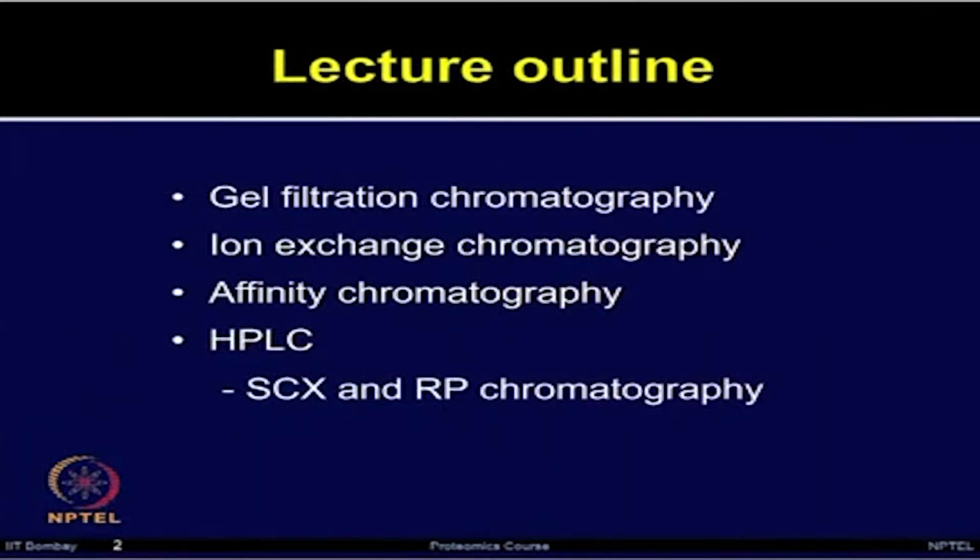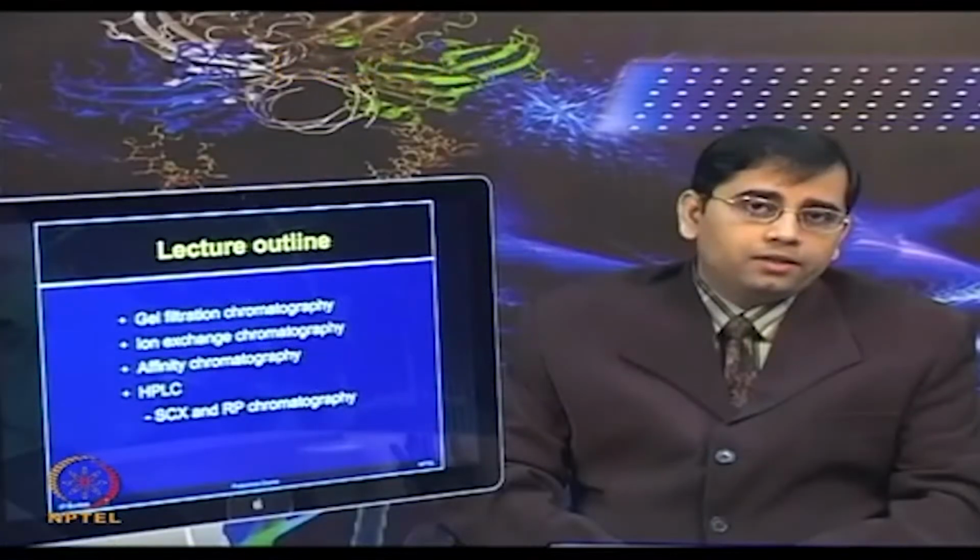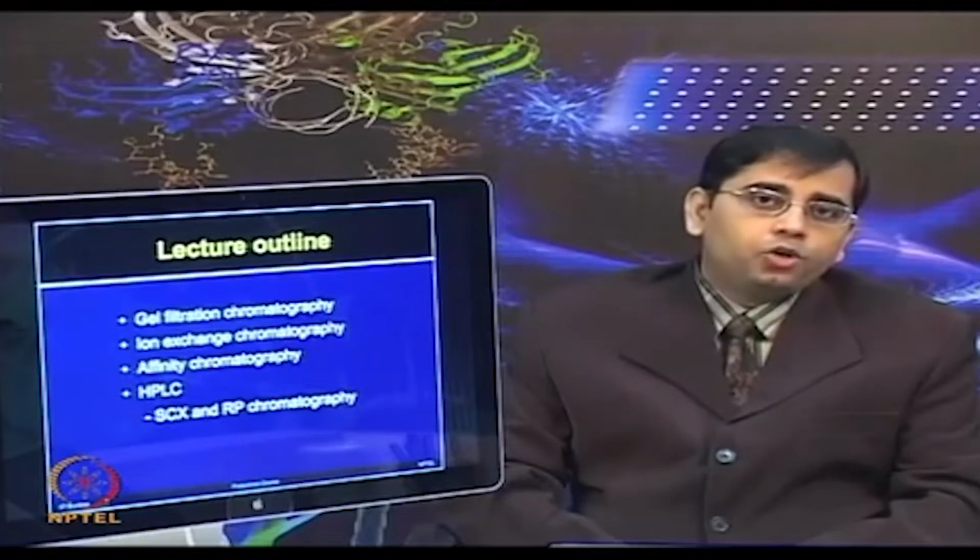The lecture outline will talk about gel filtration chromatography, ion exchange chromatography, and affinity chromatography. These methods will be discussed in light of protein purification, and then we will talk about a few methods such as strong cation exchange and reverse phase chromatography for peptide isolation using high performance liquid chromatography methods.